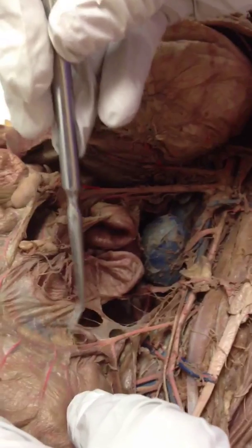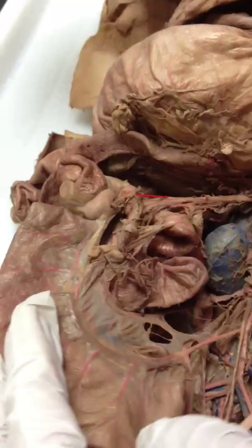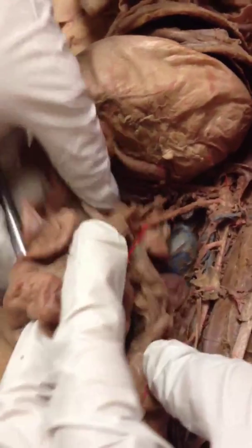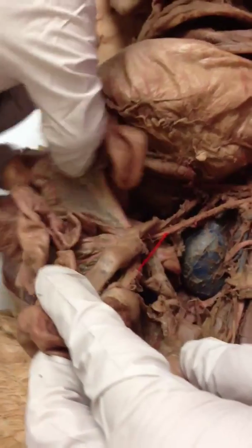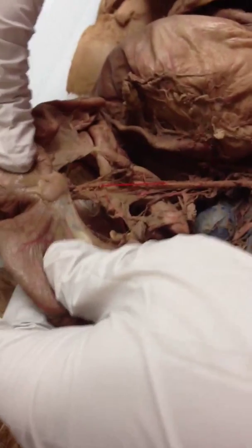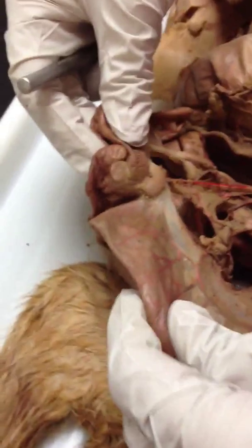Alright, and then the caudal mesenteric, we have the cranial rectal coming here. And then we have the other branch going to the left colic, which would be here, where it meets with the other one. Is it the pancreaticoduodenal? No. The middle colic. It would meet with the middle colic, like that. So is this the middle colic? No, with the one that is missing. So we can't see that branch.